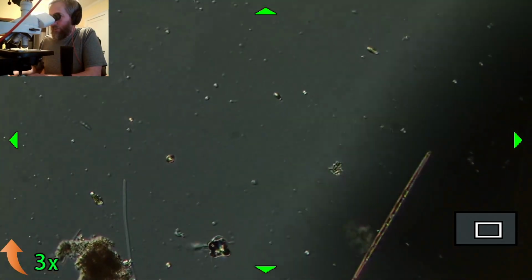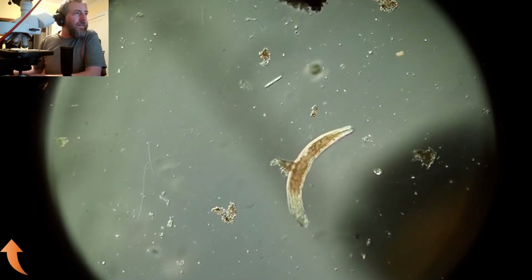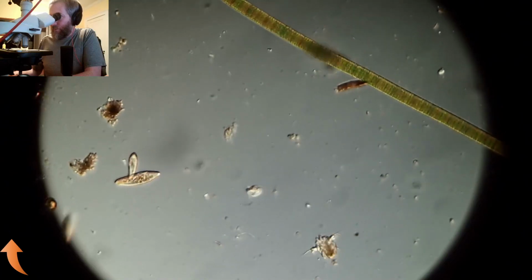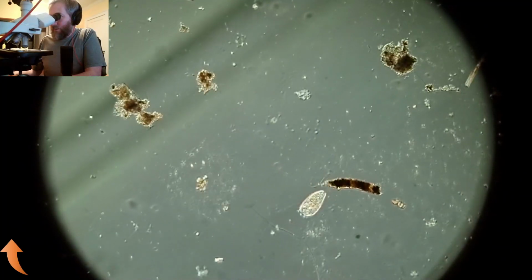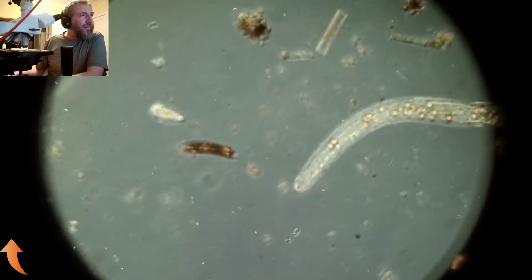Oh, there's a flatworm. Cool little flatworm. It just zoomed out of here. And some more copepods everywhere. There's one with eggs. Those were egg sacs that it was shuffling around with. That was a mama copepod. There's a little nauplius, and that thing that just got run over was a ciliate. Everybody's got excited because stuff coming from the jars suddenly got a lot of light. Stuff that's living here suddenly has a lot of water. Here's one of these guys again. Sort of bag-like creatures that we had at the beginning, the hypnotic ones. And the worm, I believe.